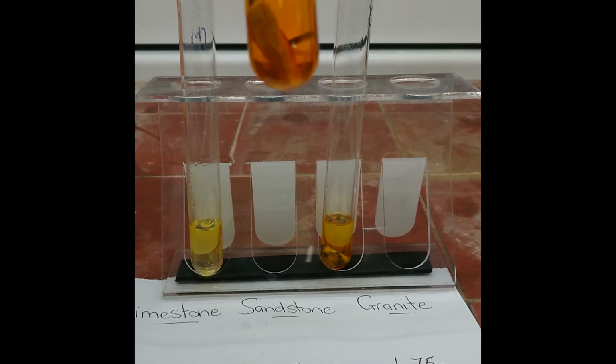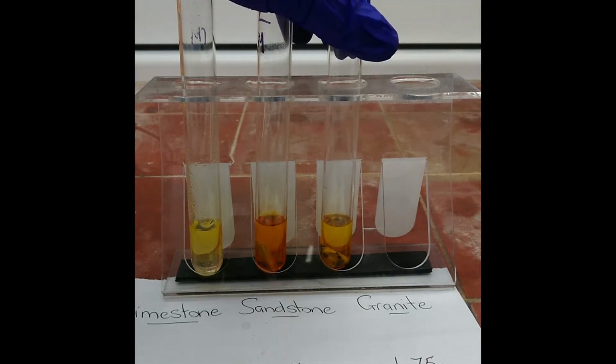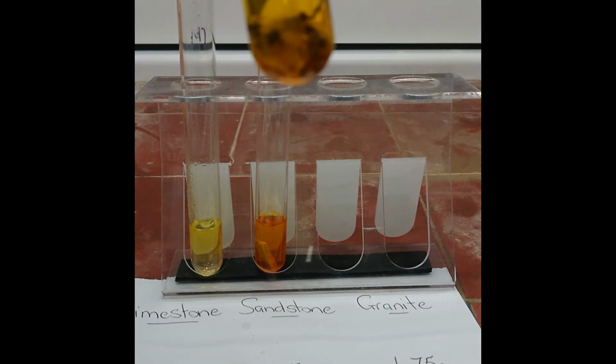The sandstone is still there. I think we're going to have to double check that with the weights to see if anything's been dissolved. And same with the granite.